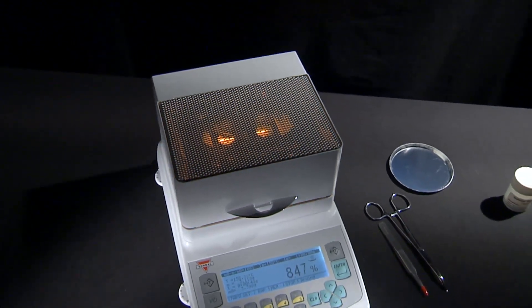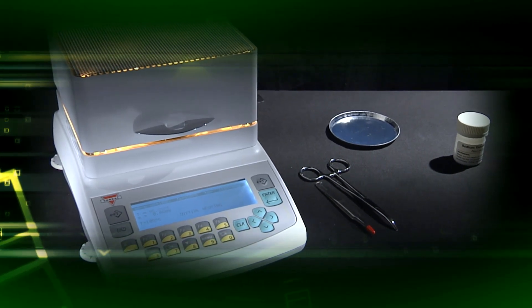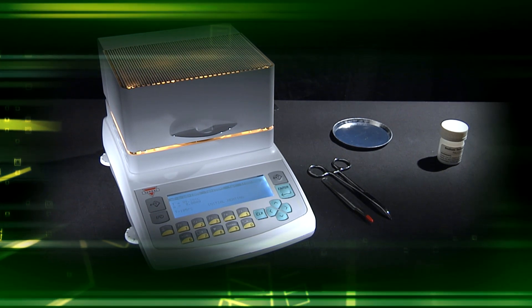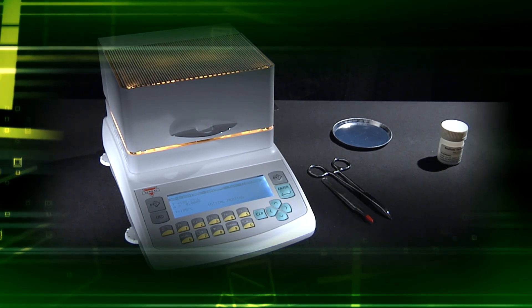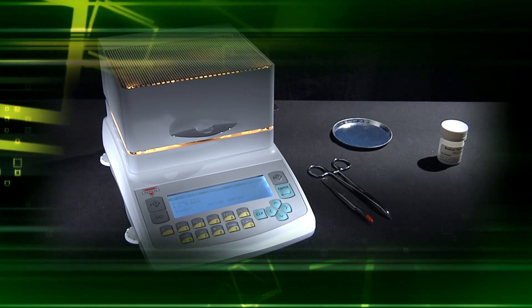The AGS provides powerful solutions in laboratory and analytical applications. With an excellent price-to-performance ratio, the Torball AGS Moisture Analyzer is ideal for value-conscious customers seeking cost efficiency in complex quality control operations.